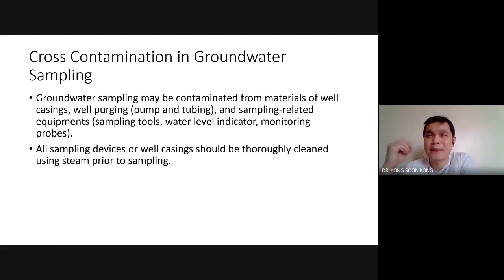And some more, when you want to collect a groundwater sample, you are going to use very long tubes. And here's the thing, these tubes are not cheap. It's not that you use a tube once and then discard it. No, it doesn't work that way. Tubes in this case have to be quite sturdy, and usually we don't discard them after one use. You will need to bring them back to the lab and clean them for second use. So let's say there are some very tough stains or contaminants from the previous sampling trip and they are not removed. That might also be a source of your contamination.